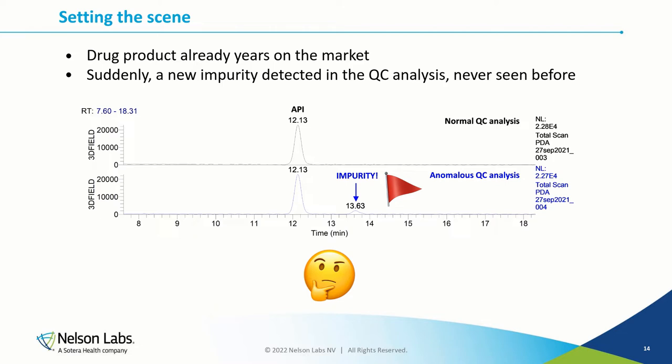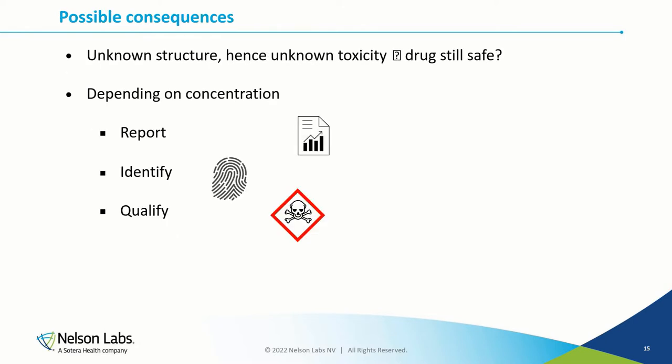The context is straightforward. We will talk about drugs that are already years on the market and suddenly a new impurity is detected in the QC analysis. As you can see on this example on the slide, for years you have a normal QC analysis appearing as the black LC-UV chromatogram on the top, and suddenly you encounter an impurity never seen before, obviously causing a red flag. It's an out-of-specification result and the batch is on hold, actions need to be defined, root cause analysis is started, and so on.